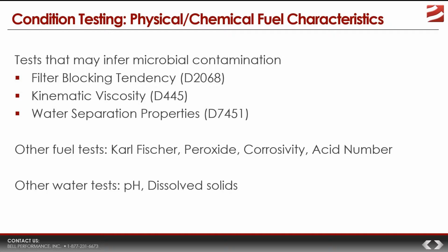Other tests we might consider, which we would split up or categorize between tests done on the fuel phase and tests done on the water phase.